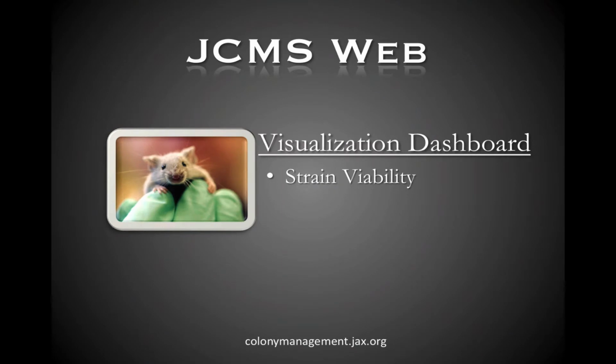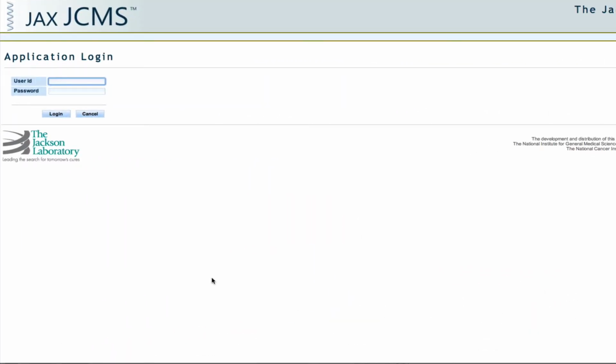In this video, I'll show you an easy-to-use visualization component which will provide you with a high-level dashboard-like view of your strain viability. Let's get started. Start by logging into JCMS Web using MTS Admin or your own credentials.